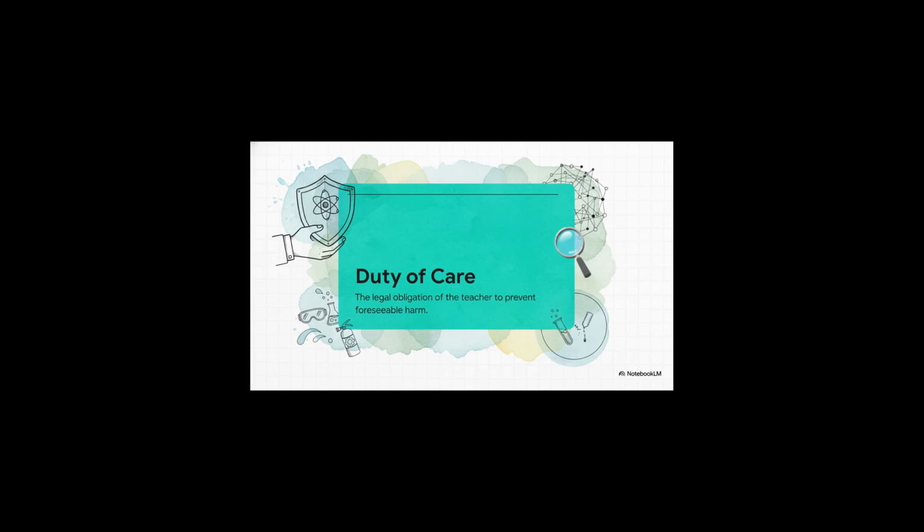At the center of all classroom safety is this really important legal concept, duty of care. And as you can see, this isn't just a good idea or a best practice. It's your legal and professional obligation. It means you are responsible for anticipating and then preventing any harm that you could reasonably see coming. This is the why behind every single rule we're about to talk about.